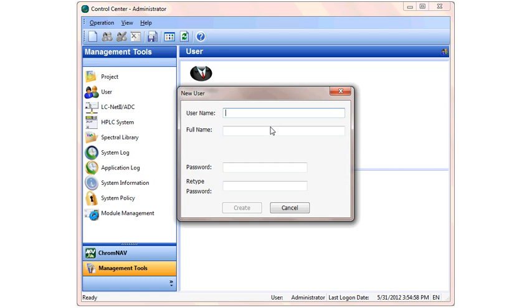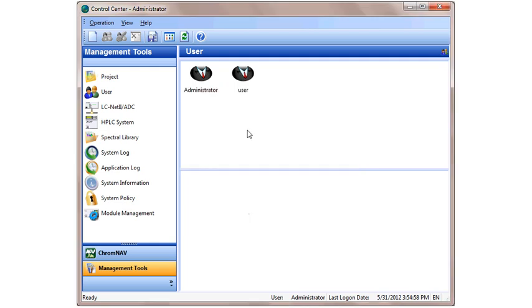Type in the username you wish. If you'd still like to use a password, you can type that in below. Otherwise, click the Create button, and you'll see you now created a new user.